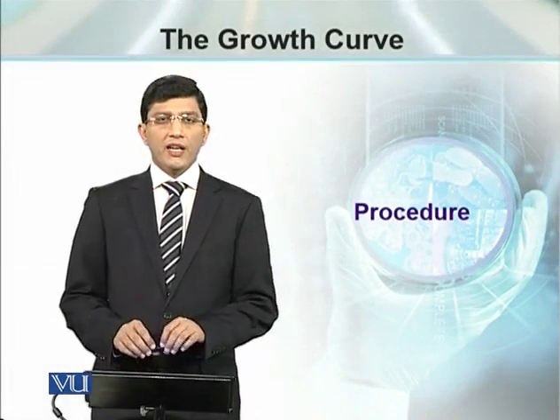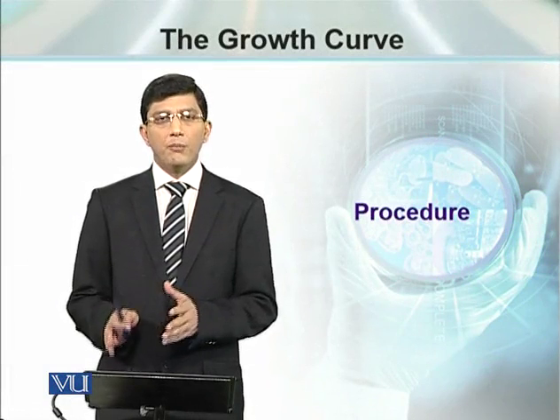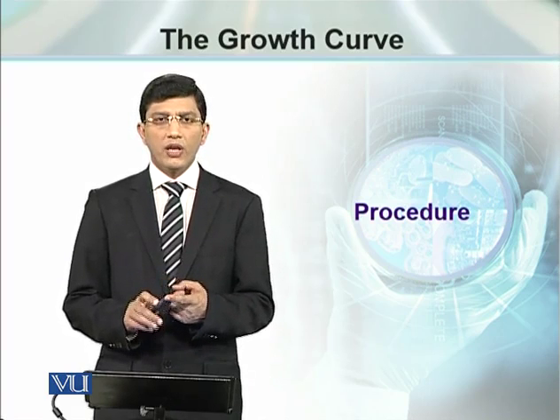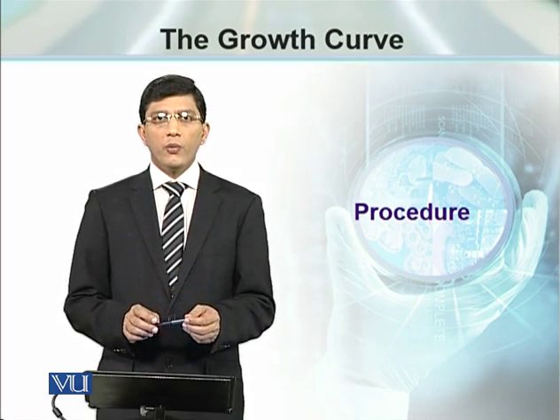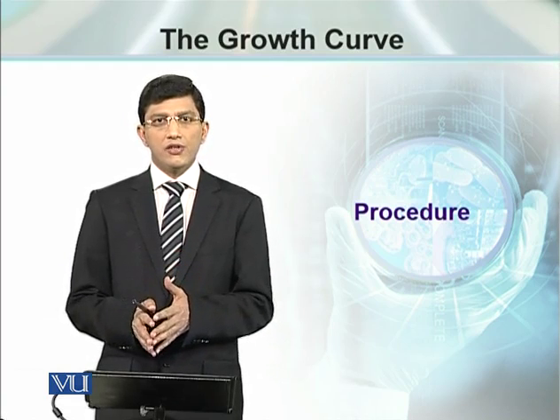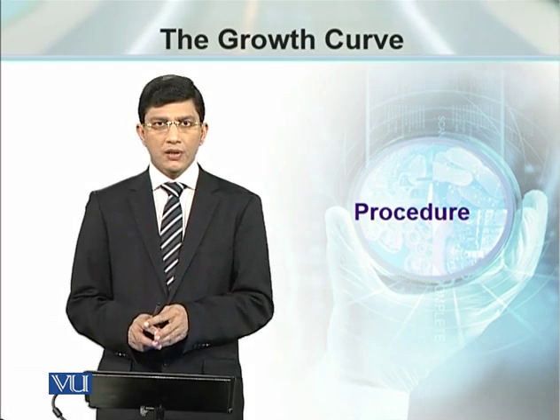अब ग्रोथ कर्व बनाने के लिए हम 3 डिफरेंट तरीकों से अपना सैंपल एनालाइज कर सकते हैं. We can perform the cell count, we can perform the colony count, and then we can observe the difference in the absorbance of any culture at particular time interval.